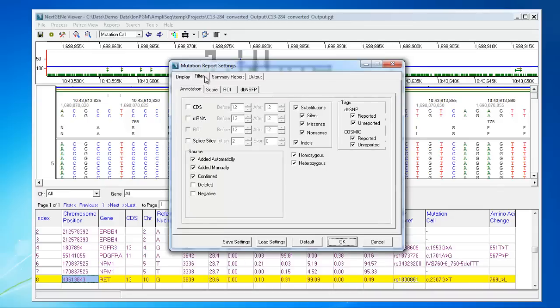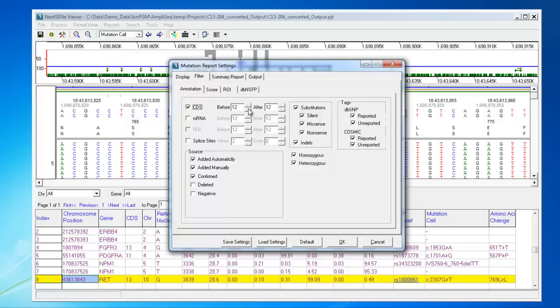On the filter tab, there are several sub-tabs that can be used to filter out variants from the report. For instance, you can choose to only show variants in coding regions, plus or minus a certain number. You can choose to hide silent variants.